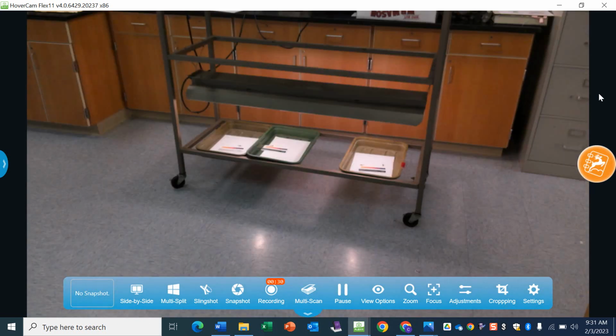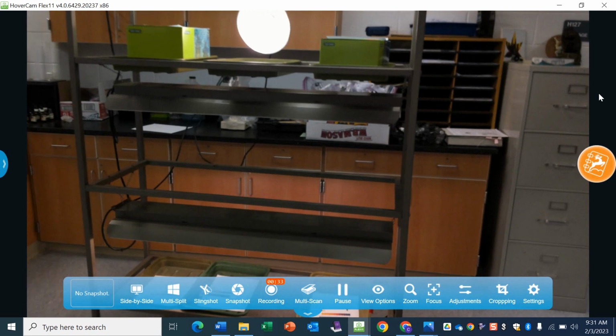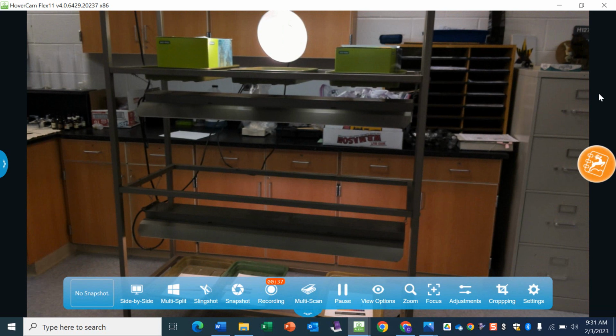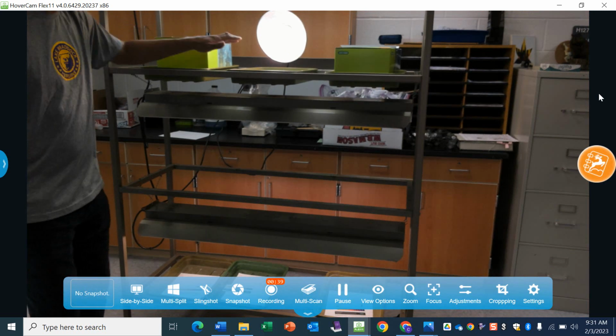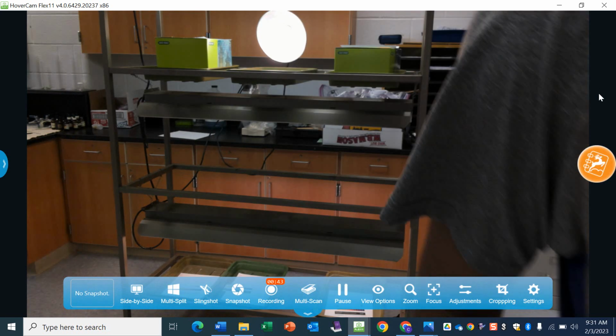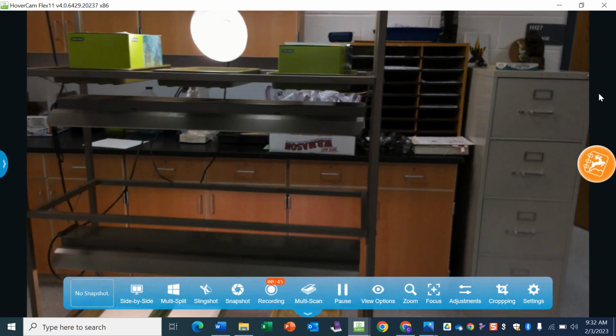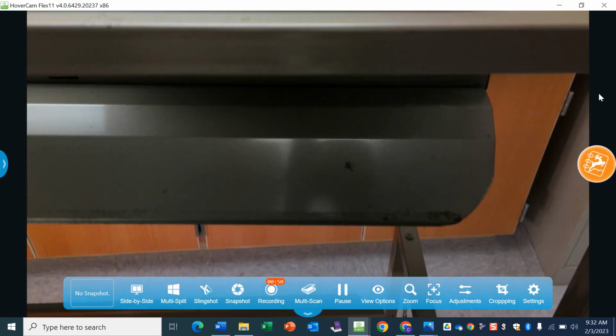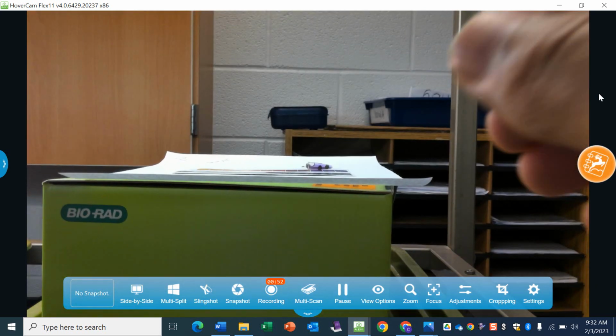As you can see here, and what I basically did is this was group 1, 2, 3, 4, 5, 6. And some of the results, I'm going to go ahead and show you group 3.